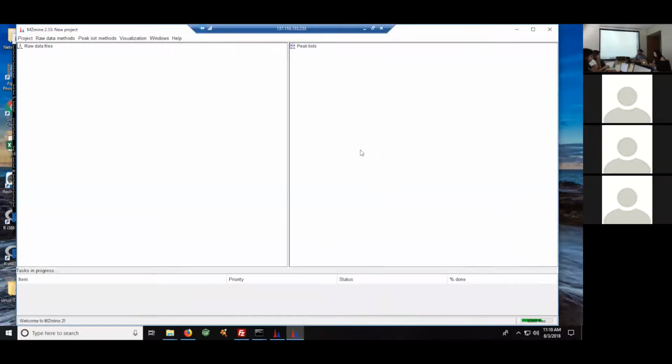So now you have basically two options. First, you can do the processing step by step manually here with the graphical user interface, or you can upload a batch file and process all the files in batch mode, which I think for later use, when you do a lot of data analysis, is the more convenient thing, because it's just fire and forget, and when you come back the next morning, it's all processed.